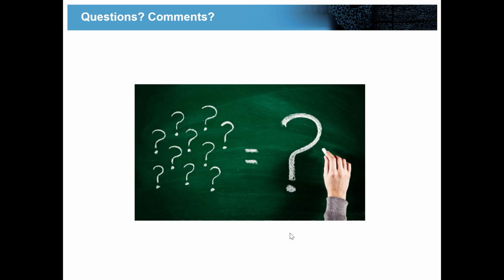The question is, if we have such a wide precursor isolation window, we can have different precursors in there that have different charge states, and we can only apply one collision energy to this precursor isolation. So should it be the one for the doubly charged or the triply charged or the quadruply charged? What we do actually is we just choose the collision energy for doubly charged. This likely means that the triply charged ones, or the higher charge state ones, are being over-fragmented.